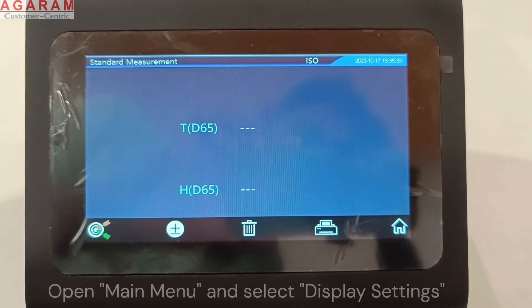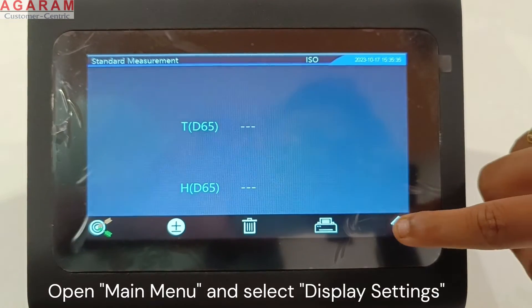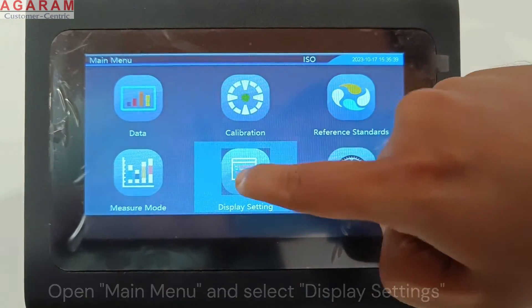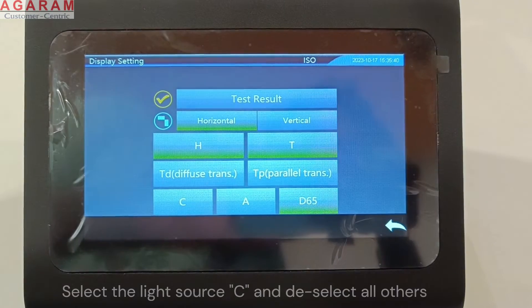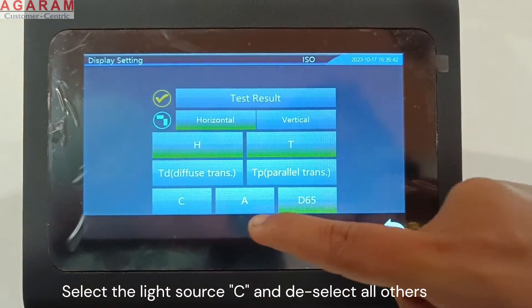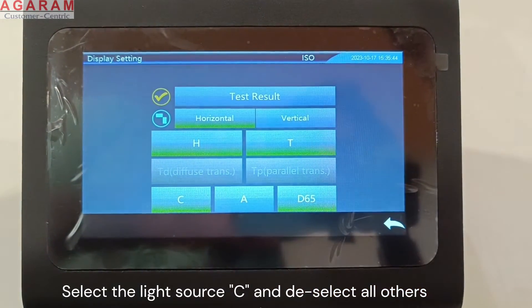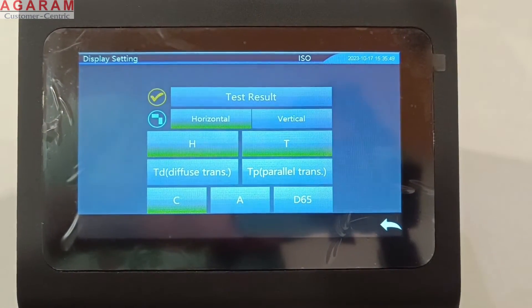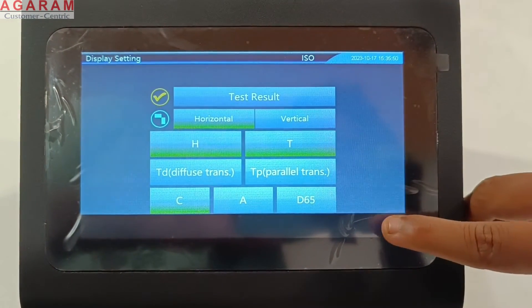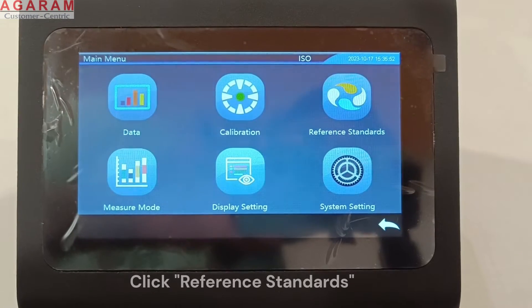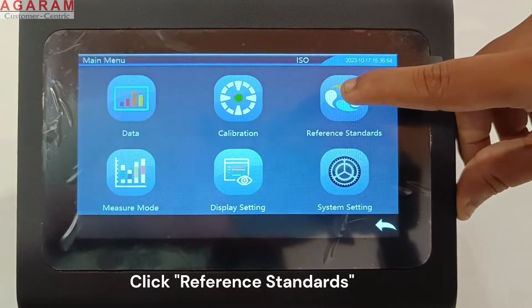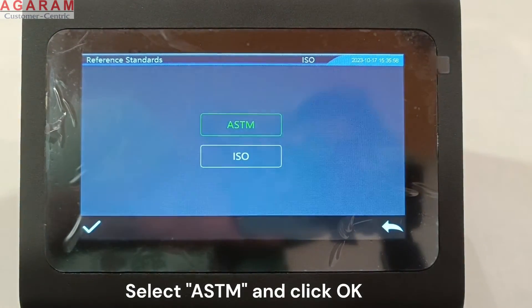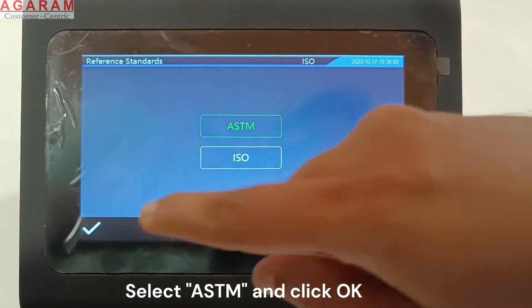Open the main menu by clicking the home icon on the left bottom corner. Now go to the display settings and ensure that light source C is selected and other light sources are unselected. Now open the reference standards and select the relevant standard that you would like to follow. In this case we are following ASTM D1003.